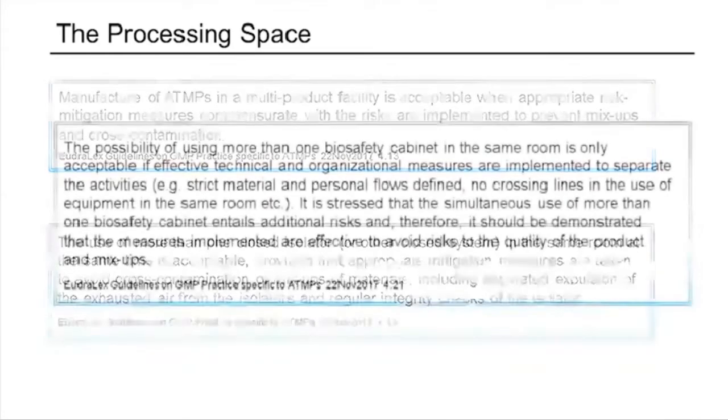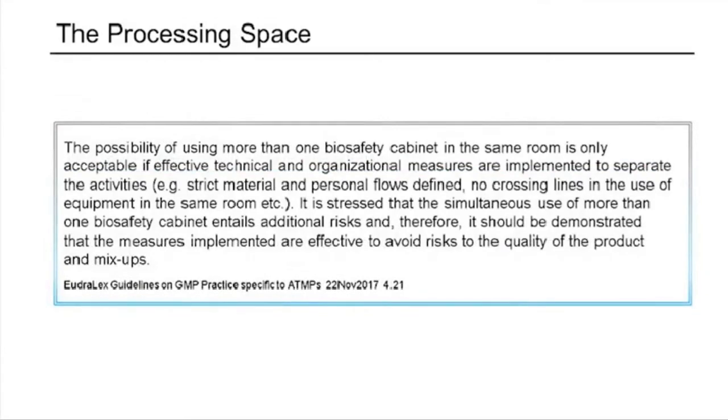But again, this is around closed processing equipment, and so you might ask, well, what if the process that we have, there just isn't a closed processing equipment offering available? Where do we go with that? So what about open processing?